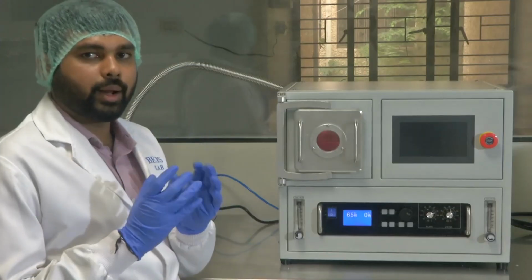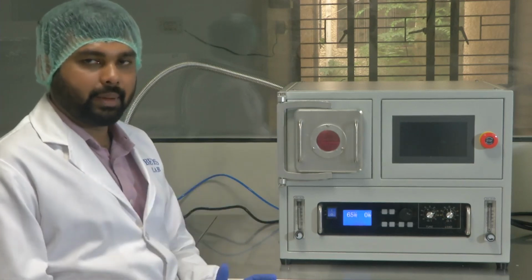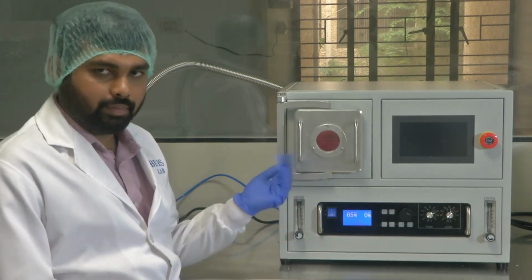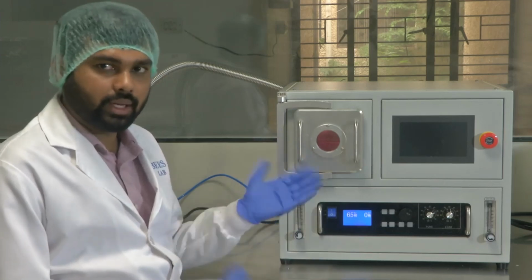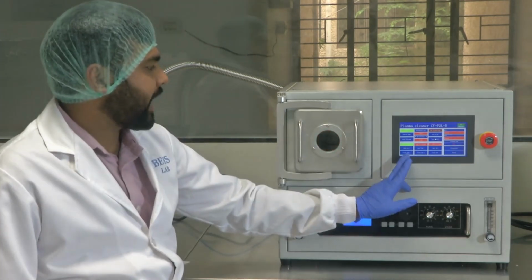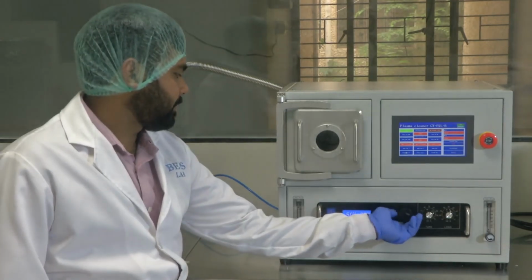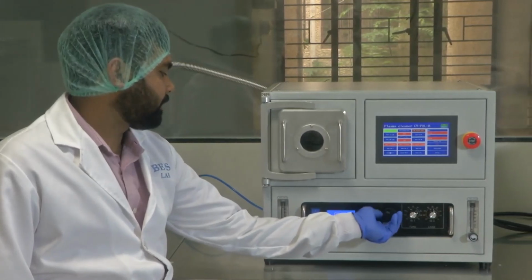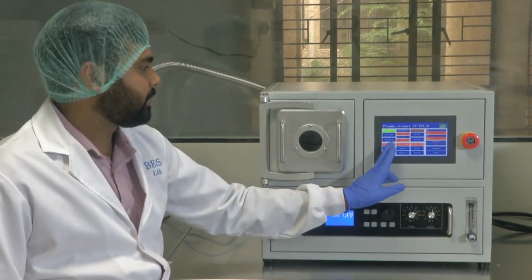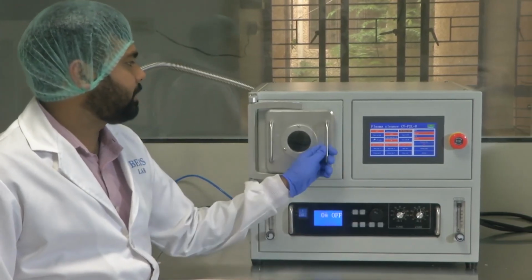So now we have done around 10 minutes of plasma treatment on the glass substrate and the PDMS membrane. Now we will follow the taking out process, or the bonding process which we will try after we evacuate the chamber. So let's first switch off the plasma, then I will close the gas vent. I will make the plasma voltage 0. Then I will turn off the pump. Okay, I have turned off the pump.